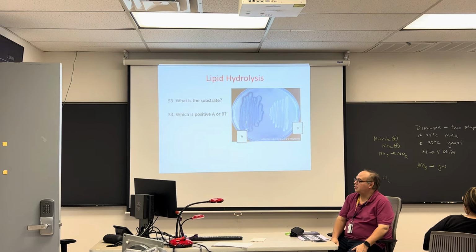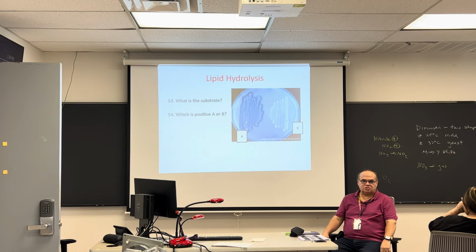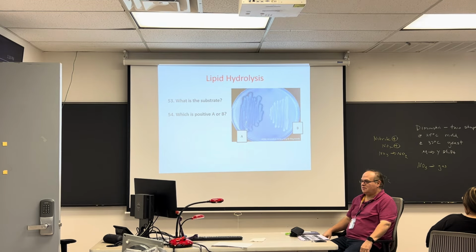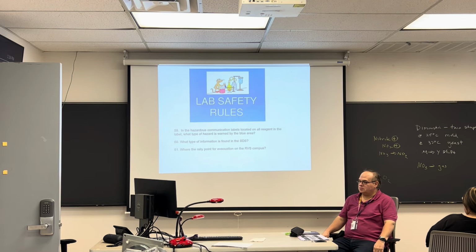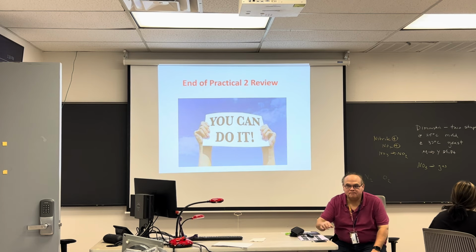Okay. And then lipid hydrolysis. What's the substrate in the lipid hydrolysis? Tributyrin. You could also say a lipid. I'm okay with that. Okay. And which one is positive, A or B? A.